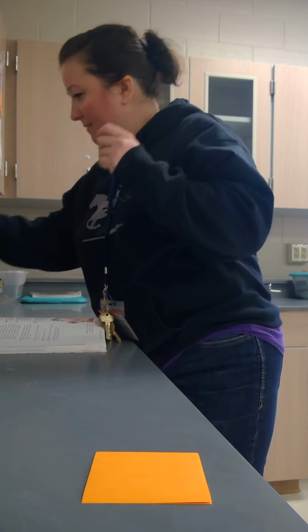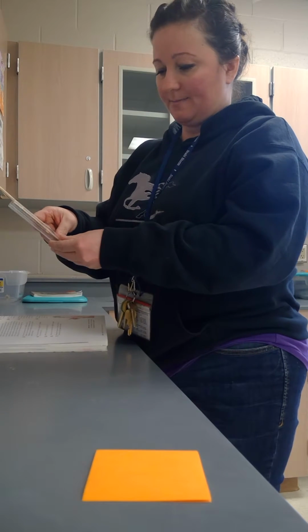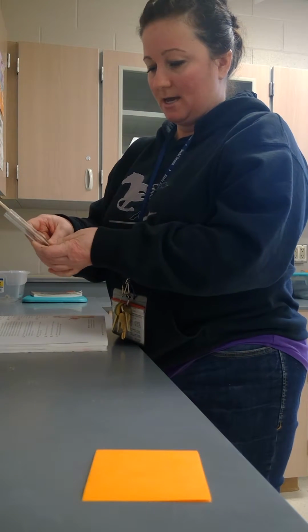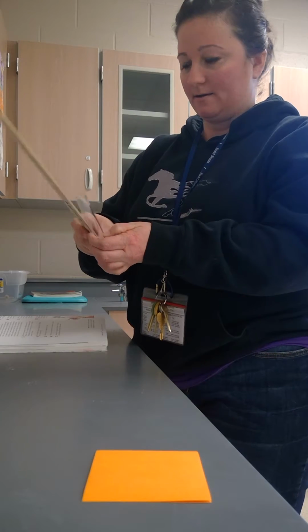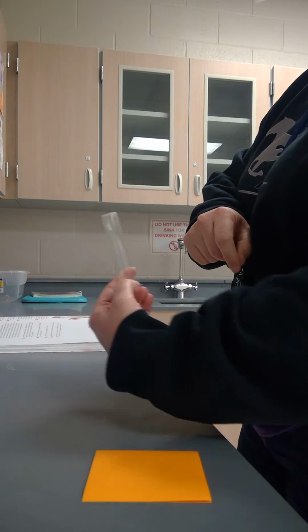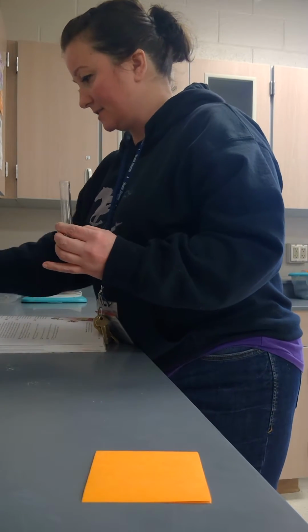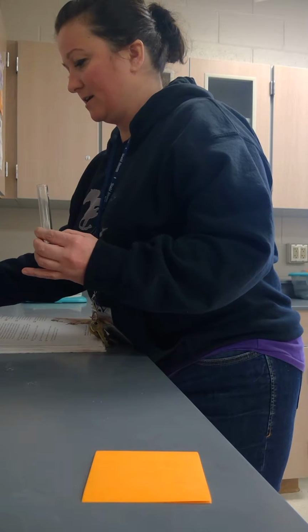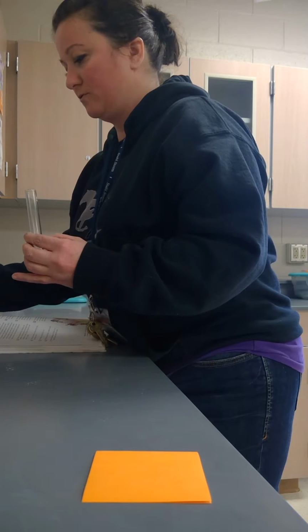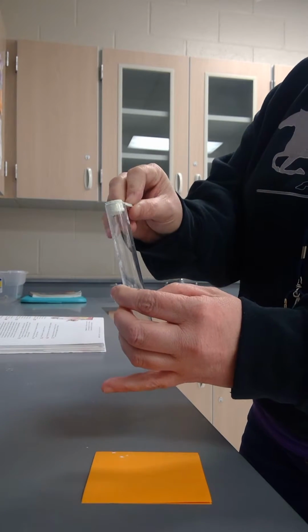And then now with our very last substance today. So again, I've got my last test tube. I know that I'm gonna measure, because I want 5 centimeters again of the water. So I've got my thumb marking where that's gonna be. Can you see that? And now I put in my 1 scoop. And this is called confectioner's sugar, a fancy word for, you've used it before in your cooking probably. We use it in icing, powdered sugar. So there's my 1 scoop, get it in there, of powdered sugar.